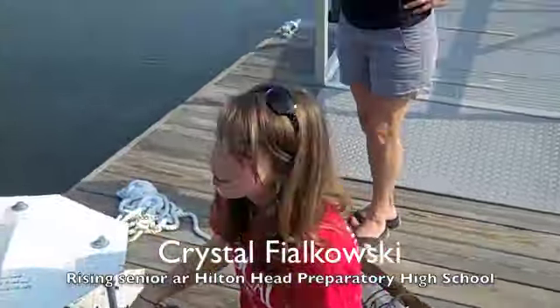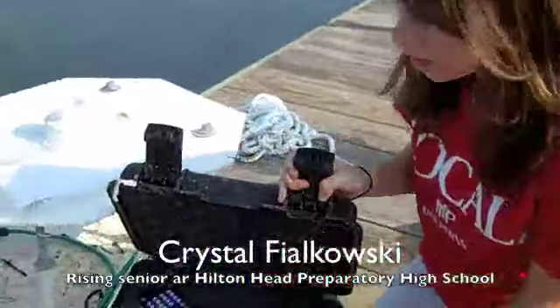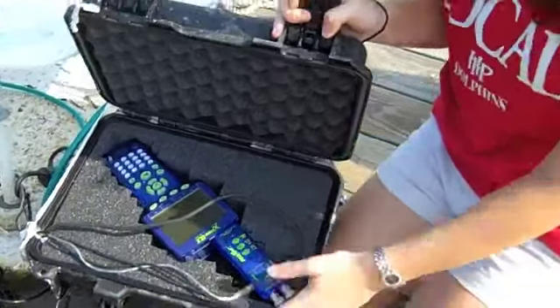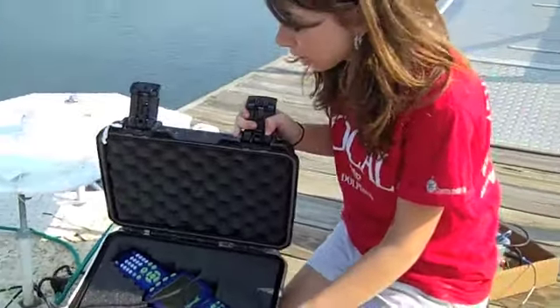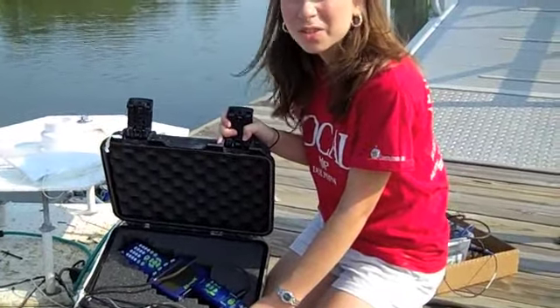Here's our sensor. And should I open it up? Yeah, that'd be great. And this is what we use to test the water. Basically, we're testing conductivity, dissolved oxygen, salinity, and it's really interesting actually to see how some of the water is affected around here. And it's interesting for the wildlife too.